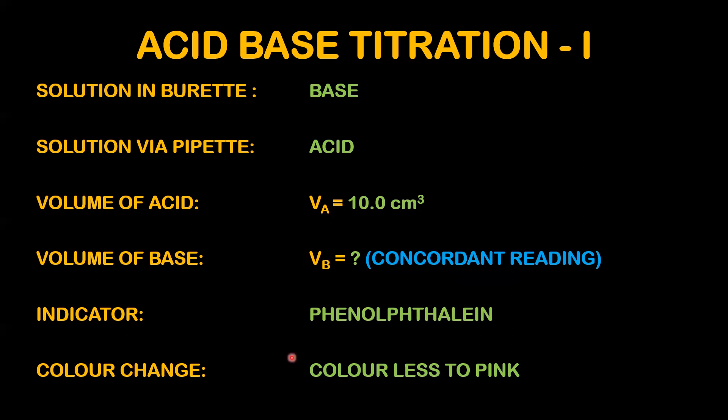When the indicator is used, and you add the base drop-wise, the color changes from colorless to pink in the conical flask. There is acid in the conical flask, and in phenolphthalein the color with acid is colorless. The end point is reached when a small quantity of base is added and the color changes.